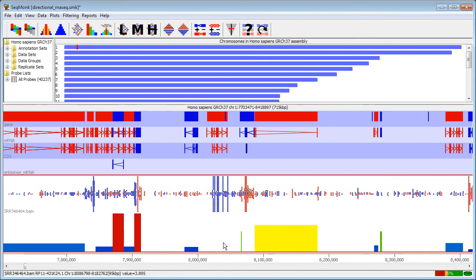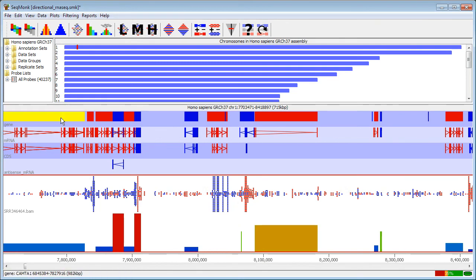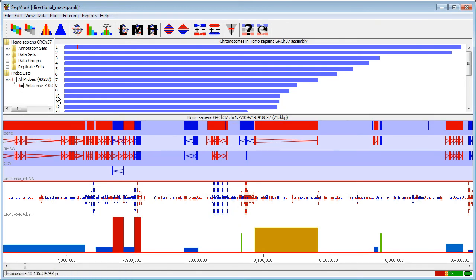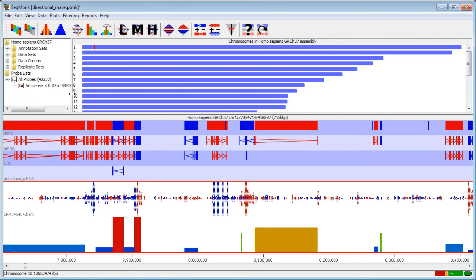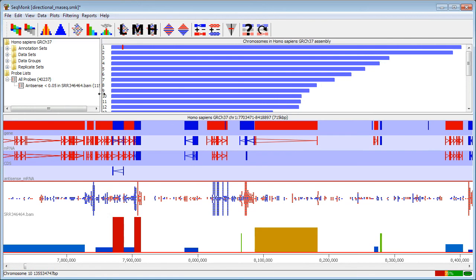In addition to performing the quantitation, the quantitation pipeline will also generate a probe list for every data set that it has. That will be the set of genes whose significance was below the threshold that you set when you ran the pipeline.